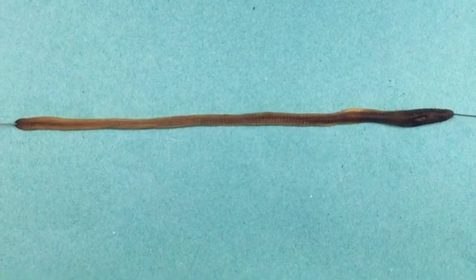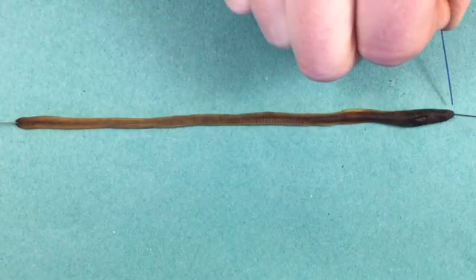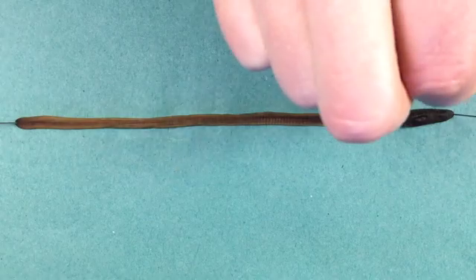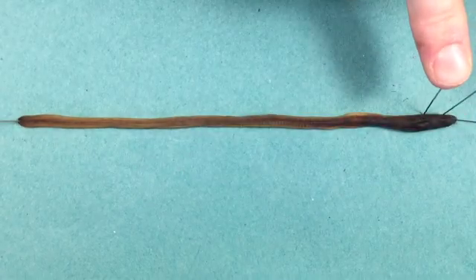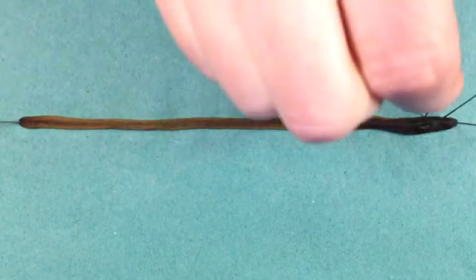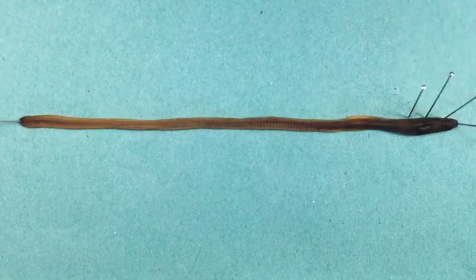It's really helpful at this stage to set up markers for segments 5, 10 and 15. You do this by counting back from segment 1: 1, 2, 3, 4, 5 — I'm going to stick a pin just next to segment 5. Then continuing: 6, 7, 8, 9, 10 — I'm not sticking it into the worm, just to the side. Then 11, 12, 13, 14, 15 — and I know that's 15 as well because I can see the male pore underneath. Those are my reference pins.